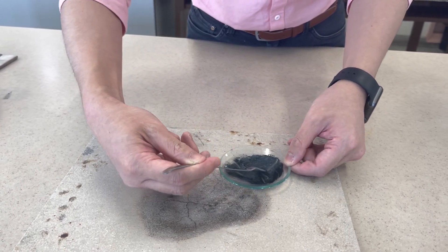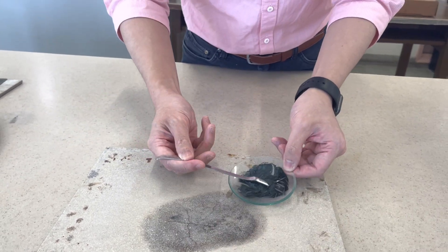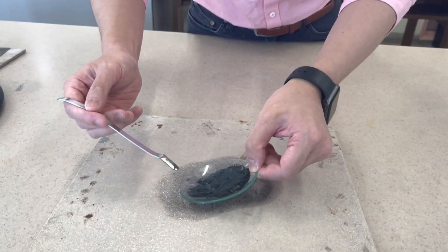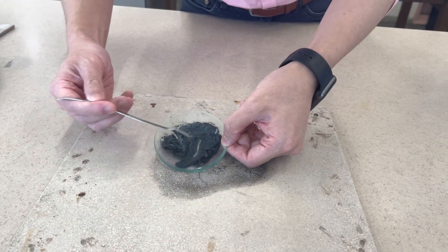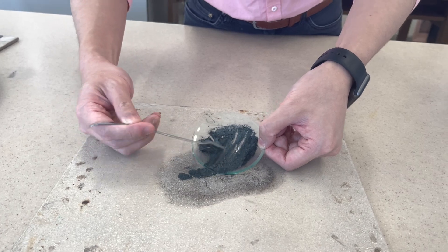After mixing, I'm going to put it on the heat resistant mat here and shape it like a sausage shape.